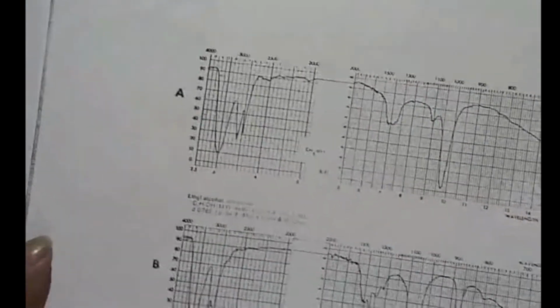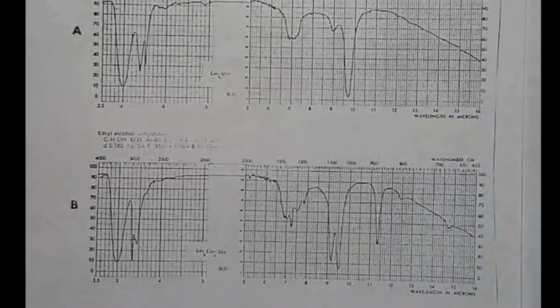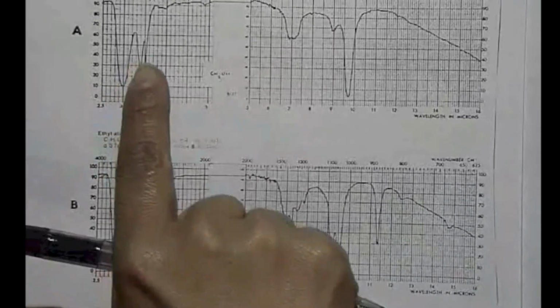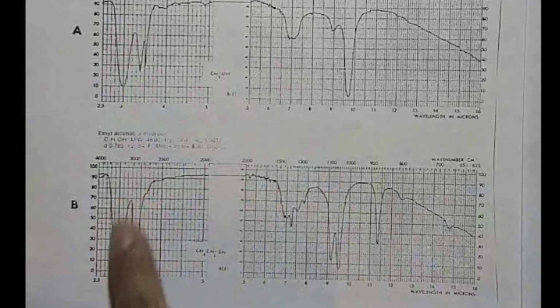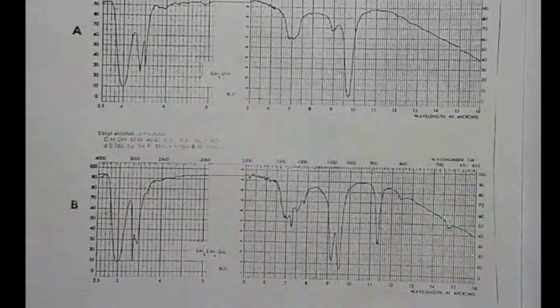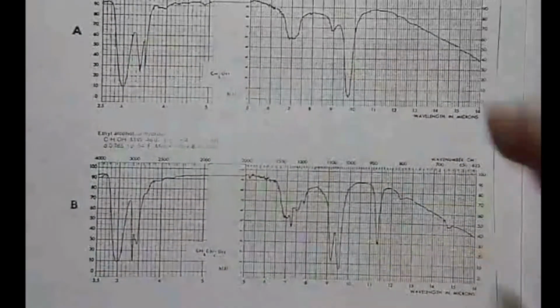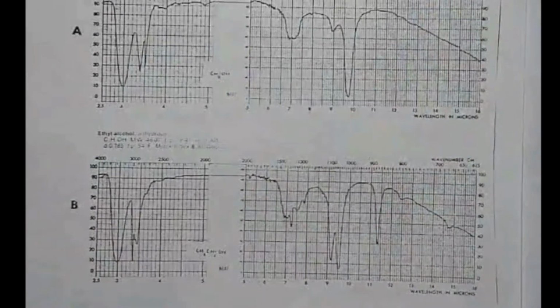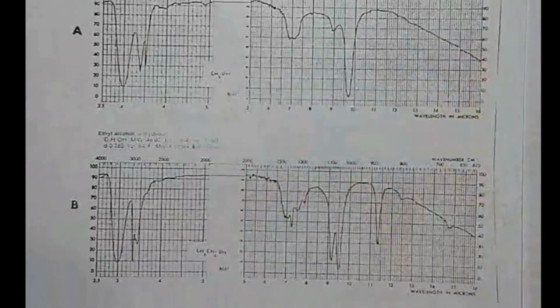Let's see. So I have here IR spectra of two compounds, and notice that the OH stretch here, which is present in both liquids, and then the rest are different peaks, and you could tell that they are different compounds because the IR is different, especially in the fingerprint region.